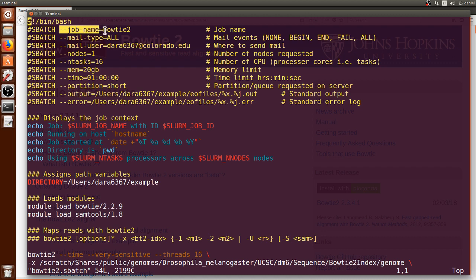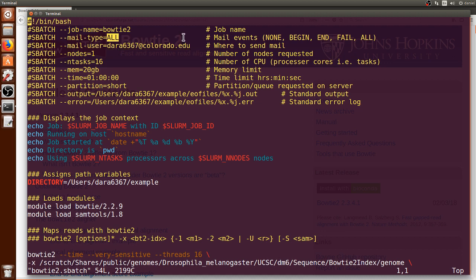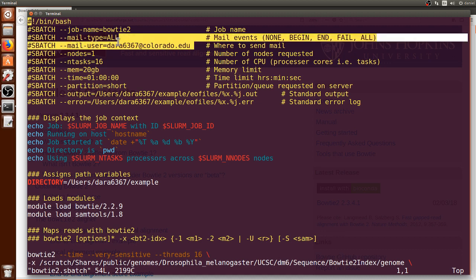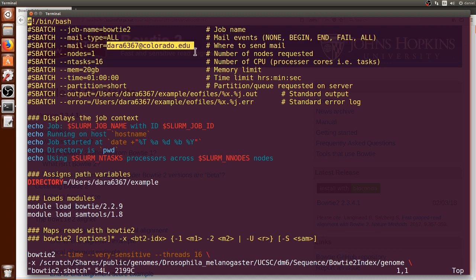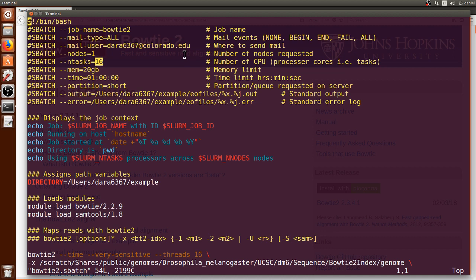Here we have the job name Bowtie2 and we are telling it to send all types of email from this run to my own email address. Here you will have to put your own. Here then we want to use one node and 16 processors to run Bowtie2 fast. In deciding how many processors to use you have to gauge how long you want to wait in the queue, such that the higher the number of processors you ask you will most likely have to wait longer in the queue.